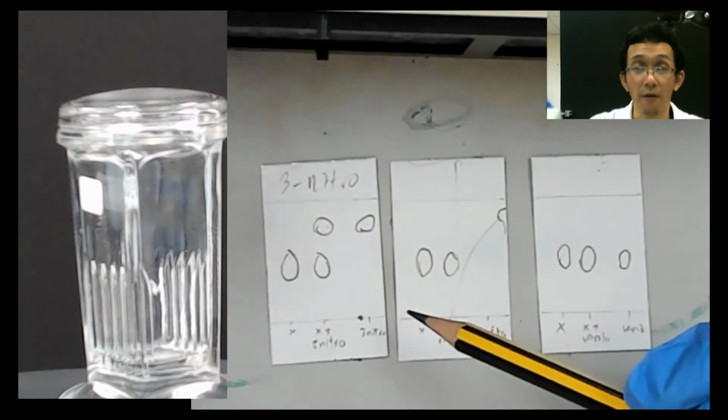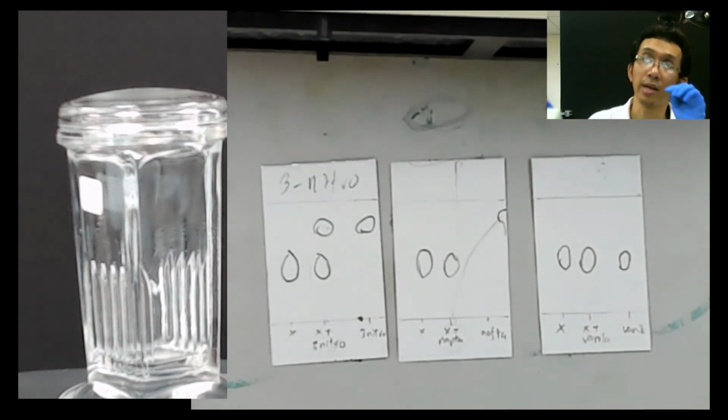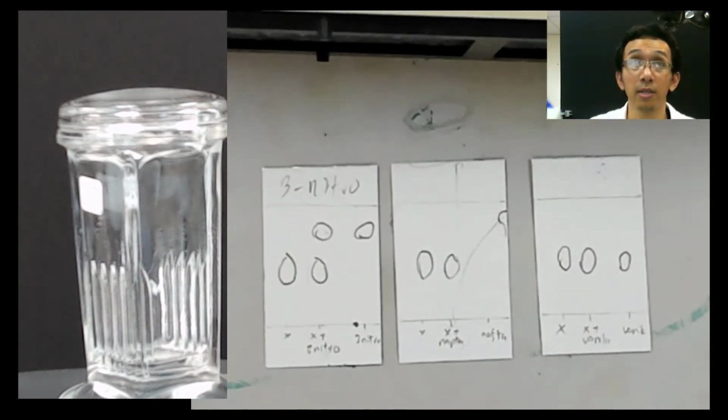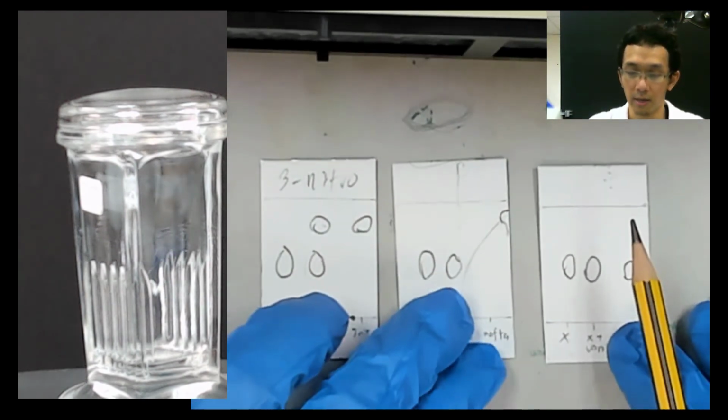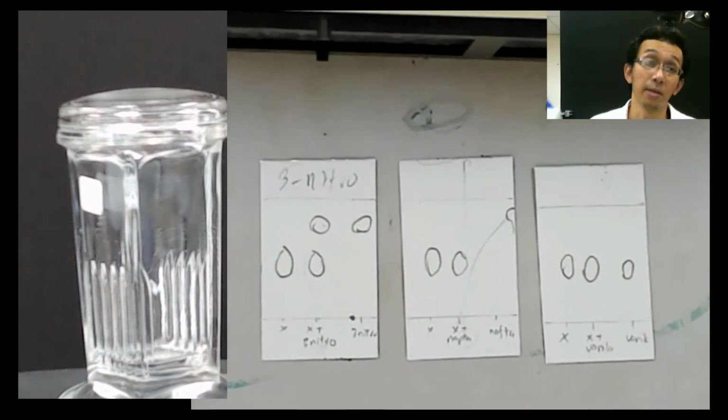So let's say you have RF 0.2 and then you find another thing with 0.2 also, then you can say it's the same thing. So that's the idea of TLC. So I just show this first. Later on, you can check this RF by taking the picture and so on.